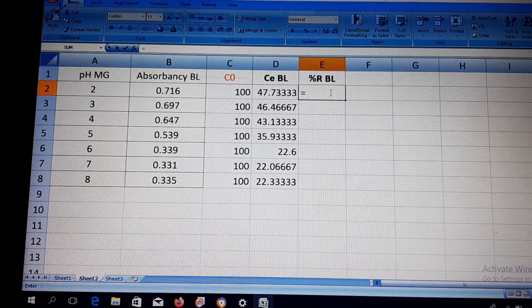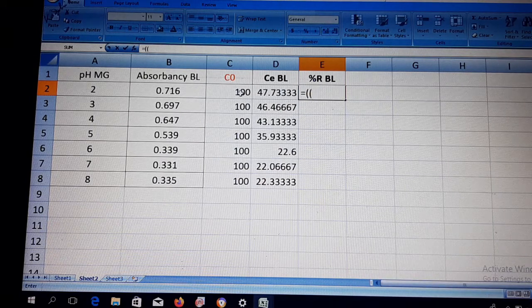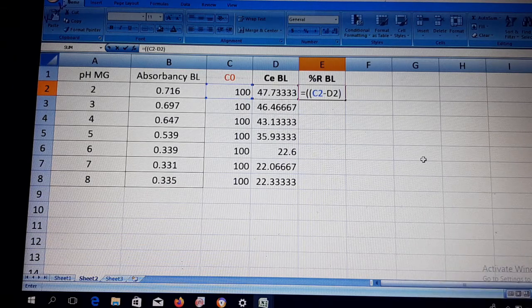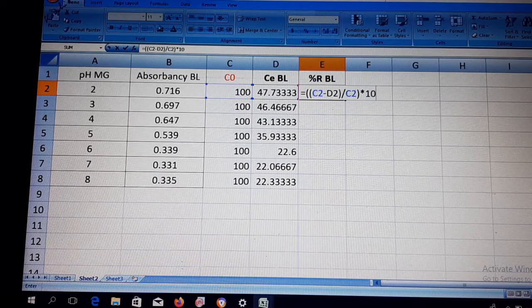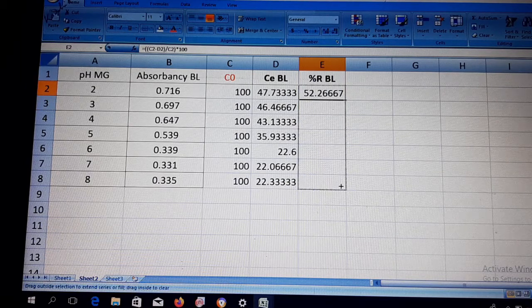Now calculate the percentage removal. The formula is: (C0 minus CE) divided by C0, multiplied by 100. Select C0, subtract CE, close the bracket, divide by C0, close the bracket, and multiply by 100. Press Enter and drag it down for all values.